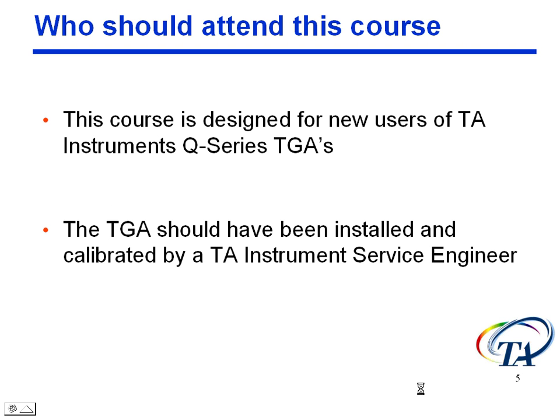Now, first off, who should be attending this course? This course is designed for new users of TA Instruments Q-Series TGAs. And by new users, we mean less than 3 to 6 months. If you've been using the equipment for a year or more, we're probably not going to teach you a lot in this course that you may not know, but it might be a decent refresher.